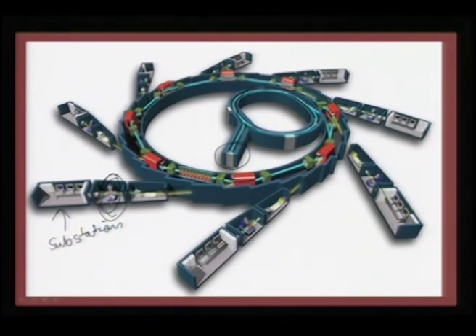So, this is more of a central facility confined in a very large space, and many laboratories can be housed together, and the output is shared by everyone at the same time. So, it is a very sophisticated structure, and the dimension of this synchrotron facility is quite huge. We will look at one of the slides to understand this.